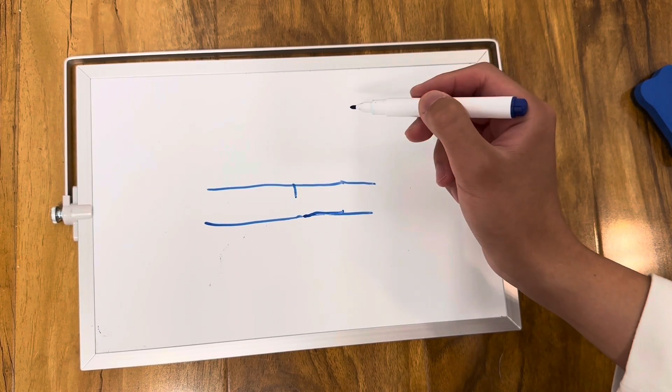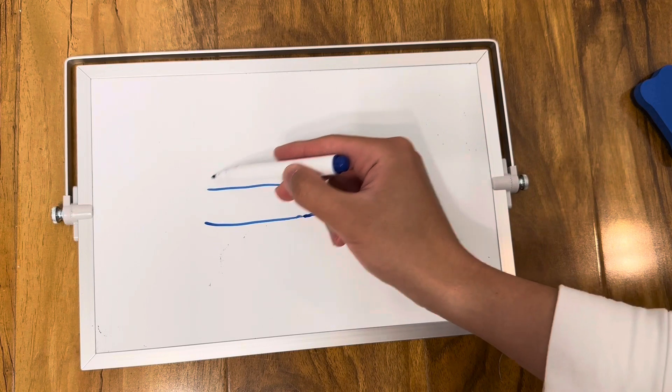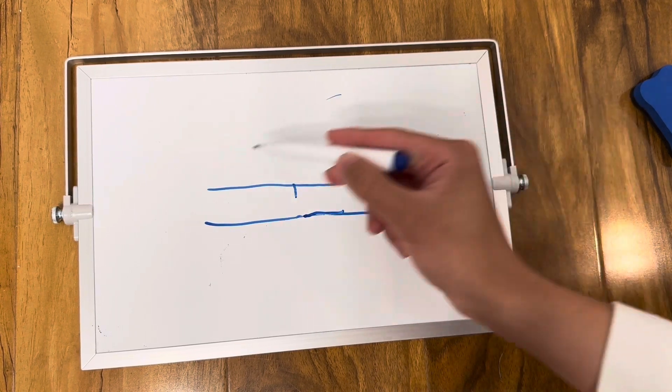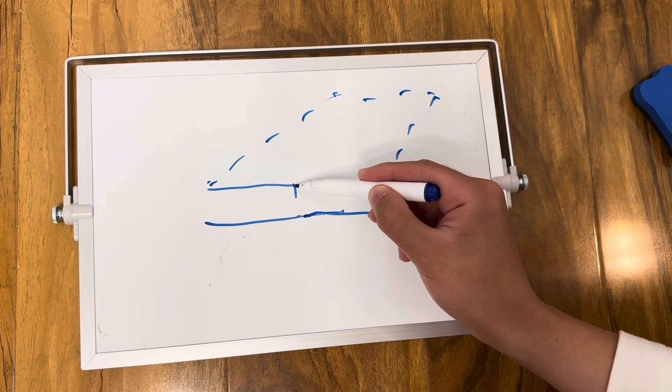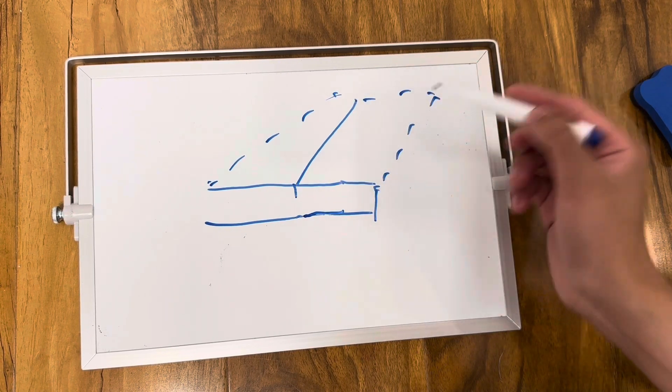Also, for the same working principle for a glass sheet as well. For a glass sheet, we can just extend the axis, like here. Same way as of a score line. First example for glass score.